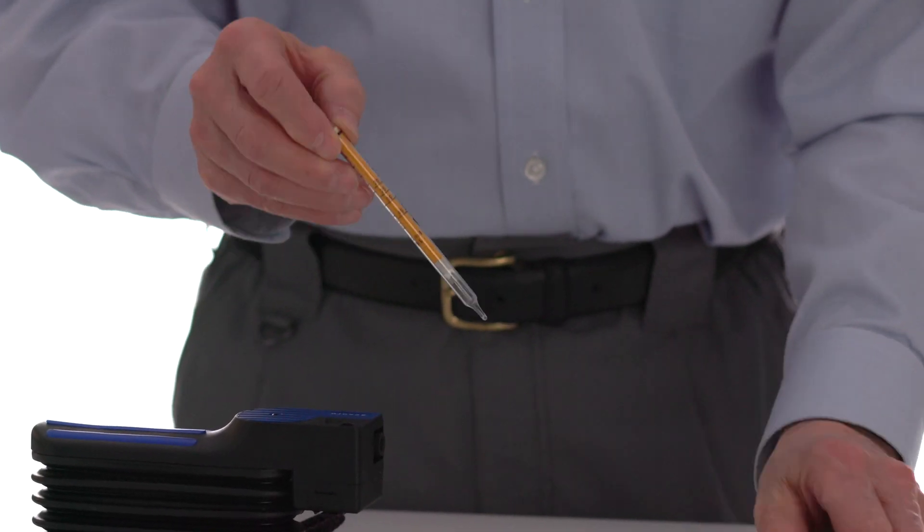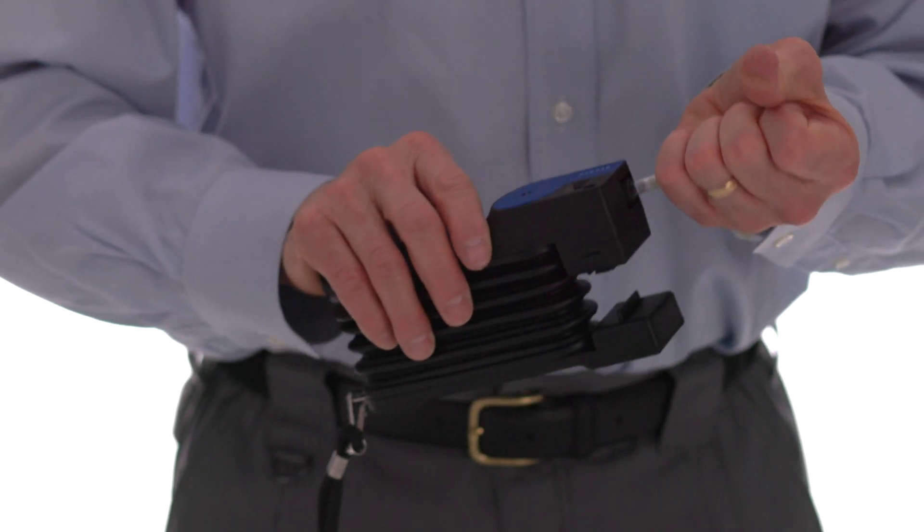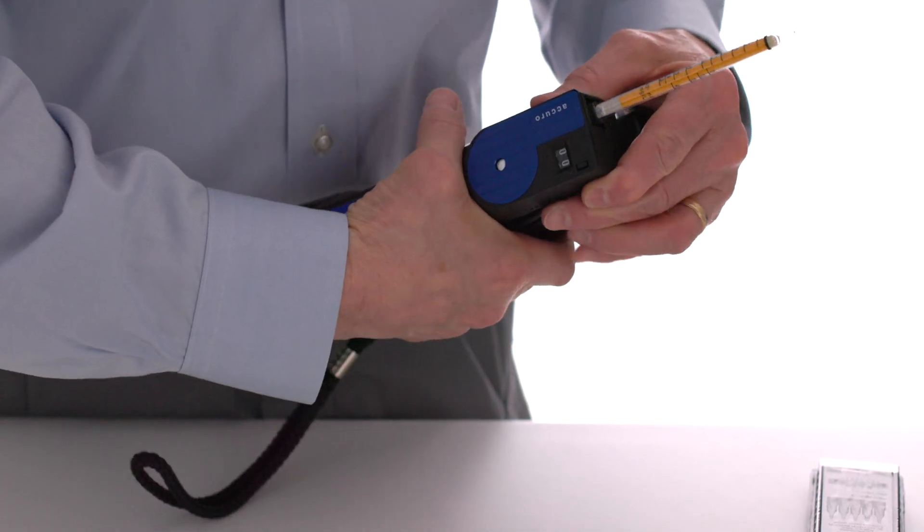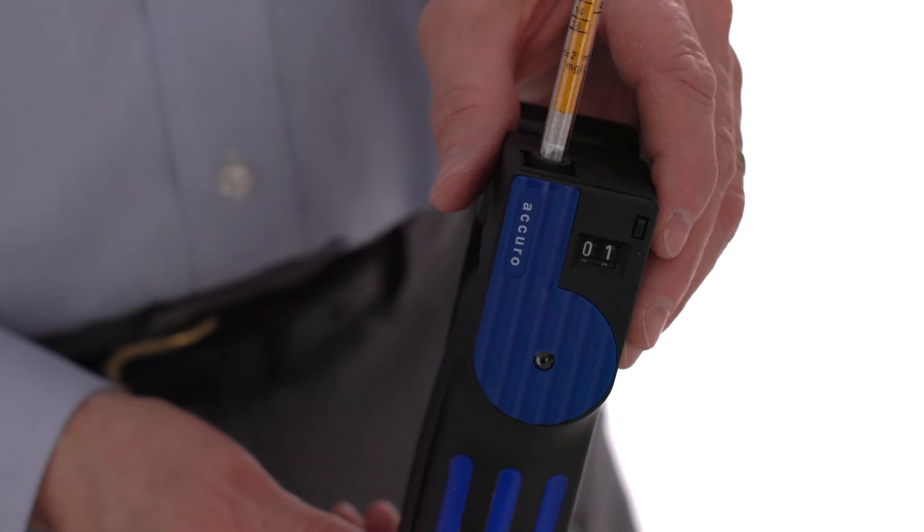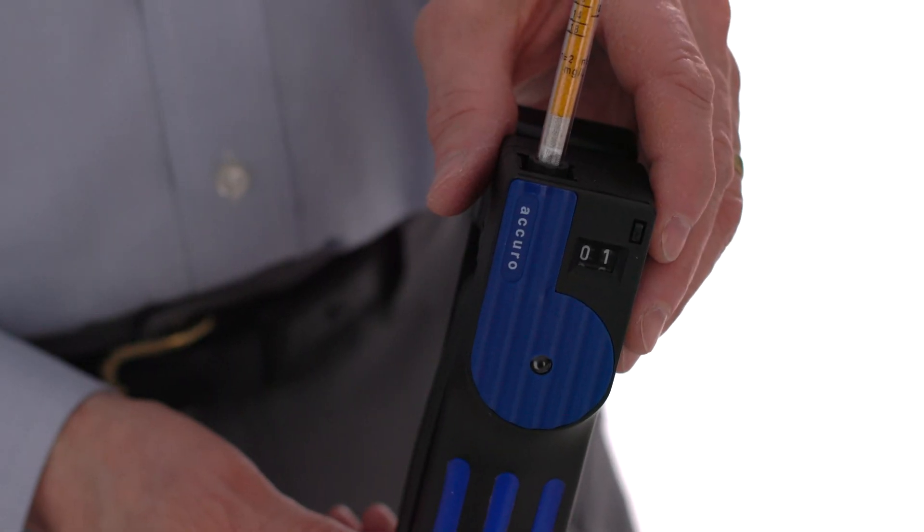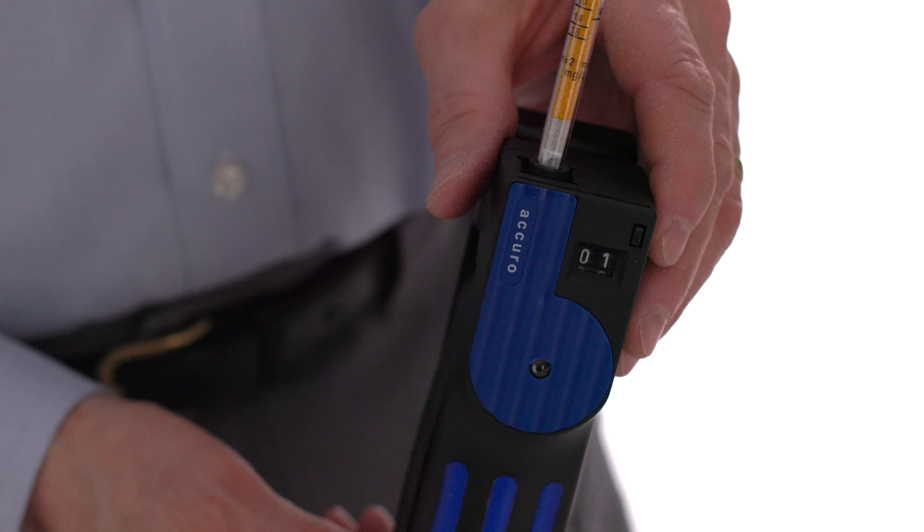Insert an unopened Drager Tube securely into the inlet and completely compress the bellows. The End of Stroke Indicator will turn from white to black. The pump is adequately leak-proof if the End of Stroke Indicator has not turned white within 15 minutes.